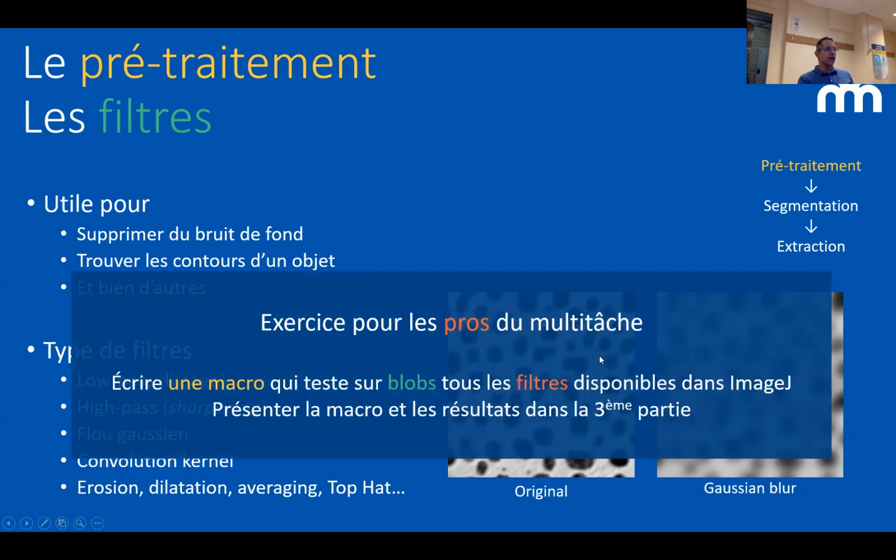And I know that some of you are already writing macros, or know a bit of ImageJ. And I was wondering if one of you could write a little macro to test on blobs the different filters that are available in ImageJ. I didn't find anything on the web that gave you clear access to what the filters are. It would be useful to have a small script or macro that can show you what the filters are and what the result is on a given image. So if you want to keep listening to the talk and at the same time write this little macro, you are welcome, and you can present it in the automation part later on.